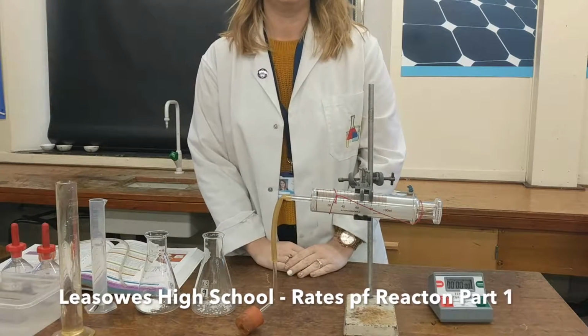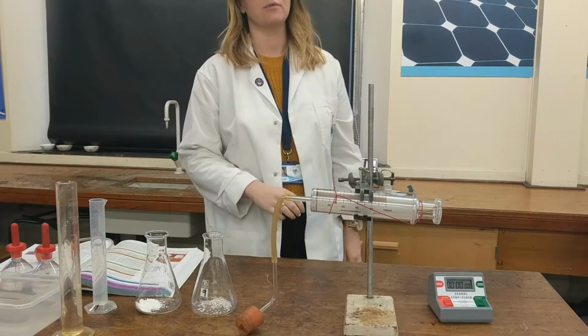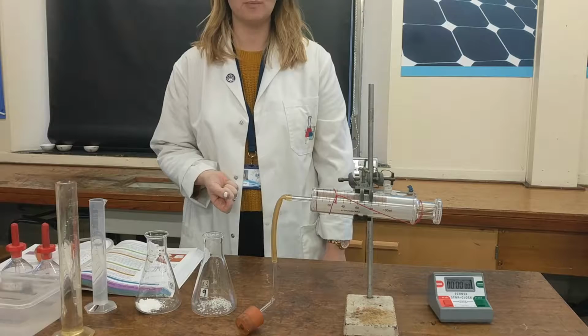This is the Investigating Rates core practical, and there's two parts to this practical. The first bit is investigating the rate of a reaction by collecting a volume of gas. Now there's two pieces of apparatus we can use for this, and I'm going to show you both today.